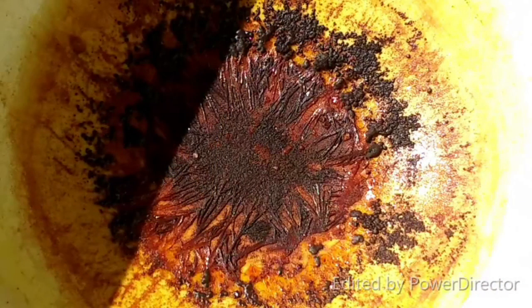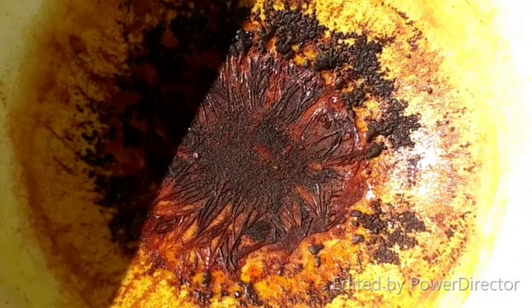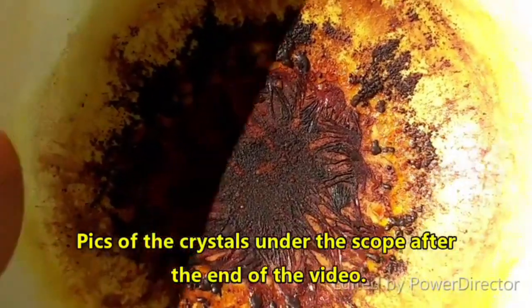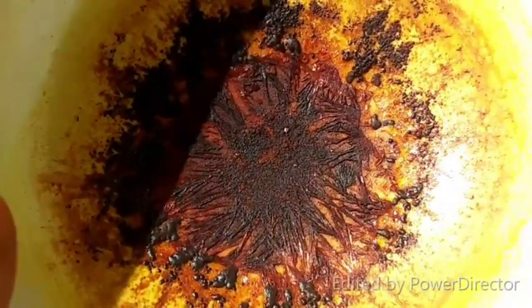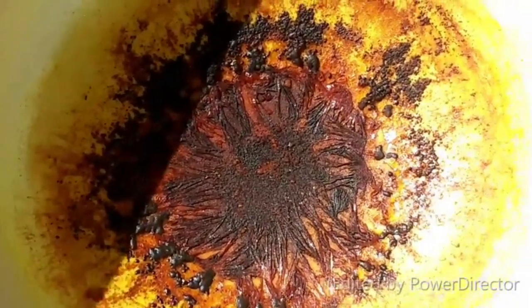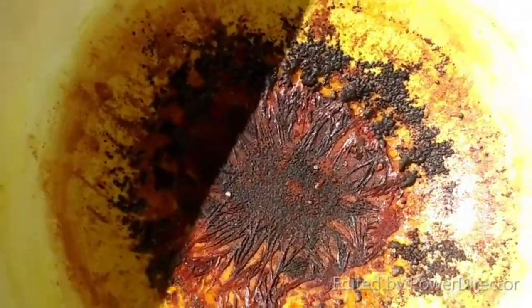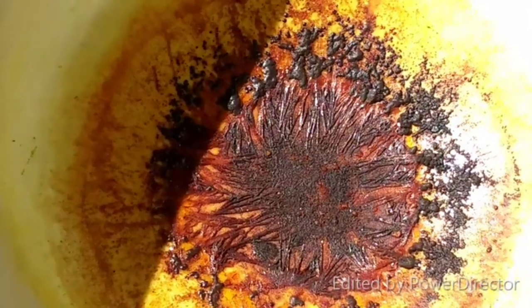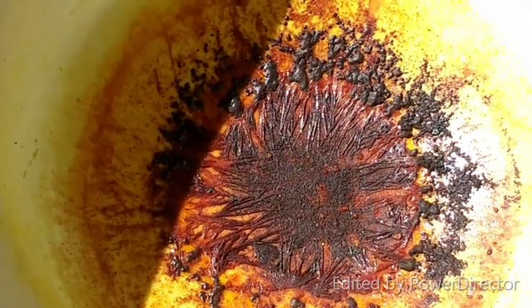Okay, everybody, there we go. Crystals of cesium uranyl thiocyanate. And we're going to stick with the common name because I'm still not sure about the proper name. They sparkle. Look at them. They're absolutely beautiful. Focus, you piece of shit. Focus on the glory of my creation. Ah, this is so awesome, man. It is so intensely gratifying to take a sentence off atomistry and turn it into something cool.